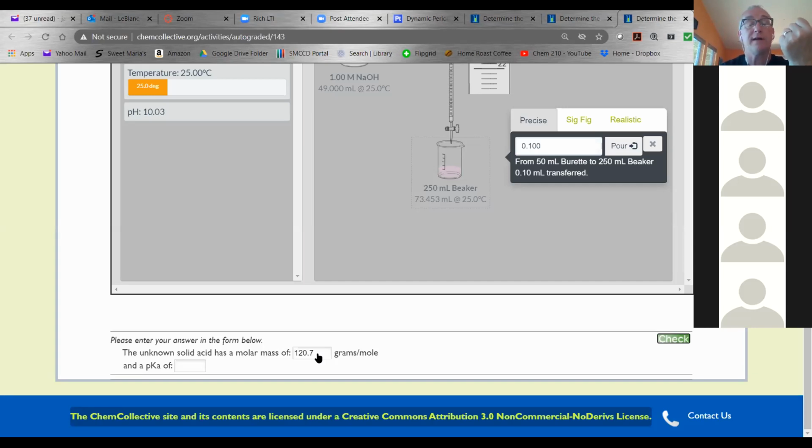So don't worry. Whoever said they got 104, that's probably right, because they're all going to be slightly different. I think they're all going to be somewhere between like 75 and 150, something like that, because those are the typical sizes of the organic acids we use in labs.